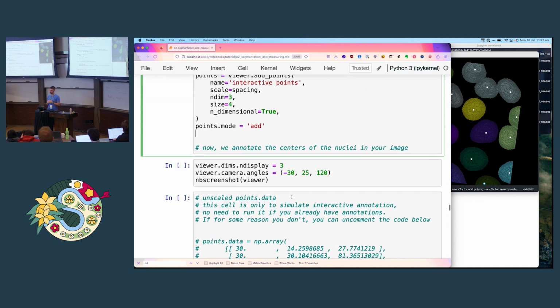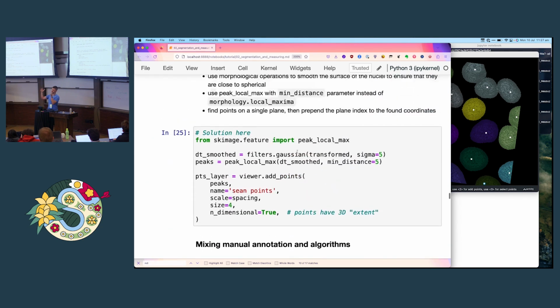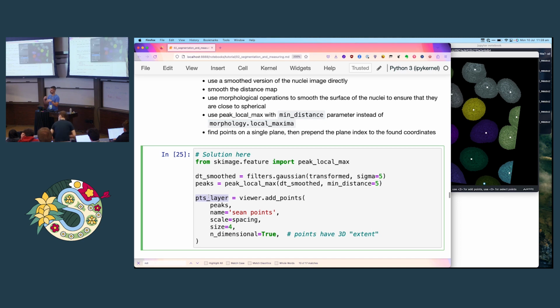So in order to avoid some of those issues, I'm running a dilation, which makes the markers a bit bigger, so they might be bigger than whatever local environment they're embedded in. And then I do the watershed, giving the edges image, the markers that I've just defined, and a mask so that it doesn't flood into the background.